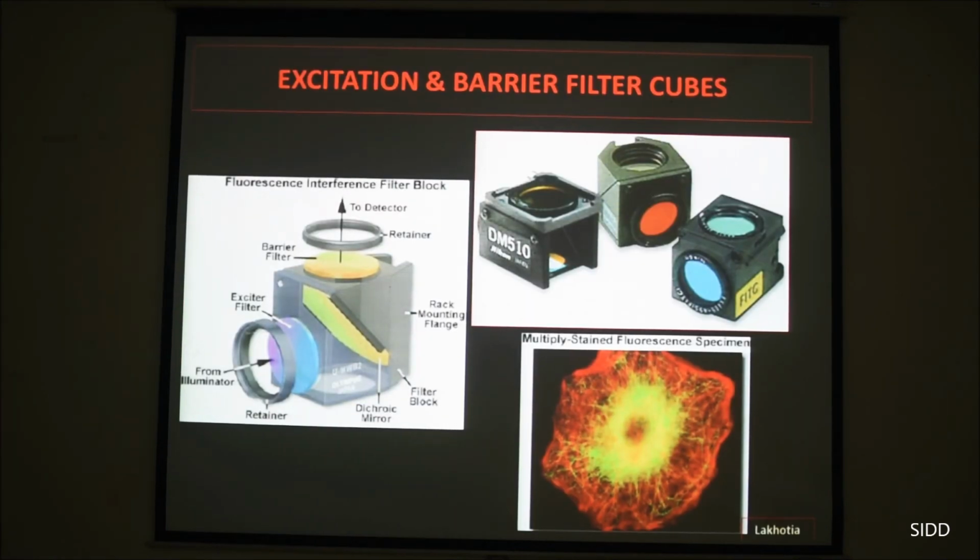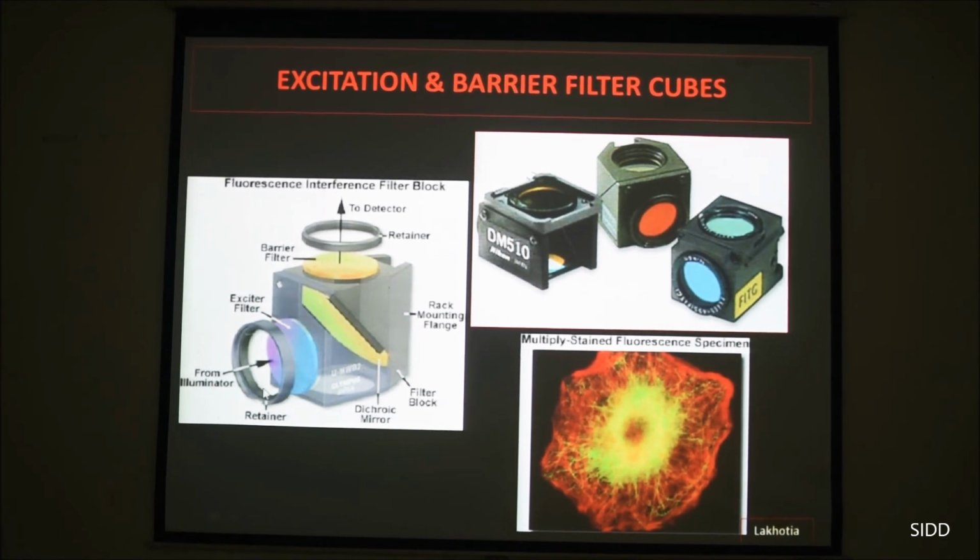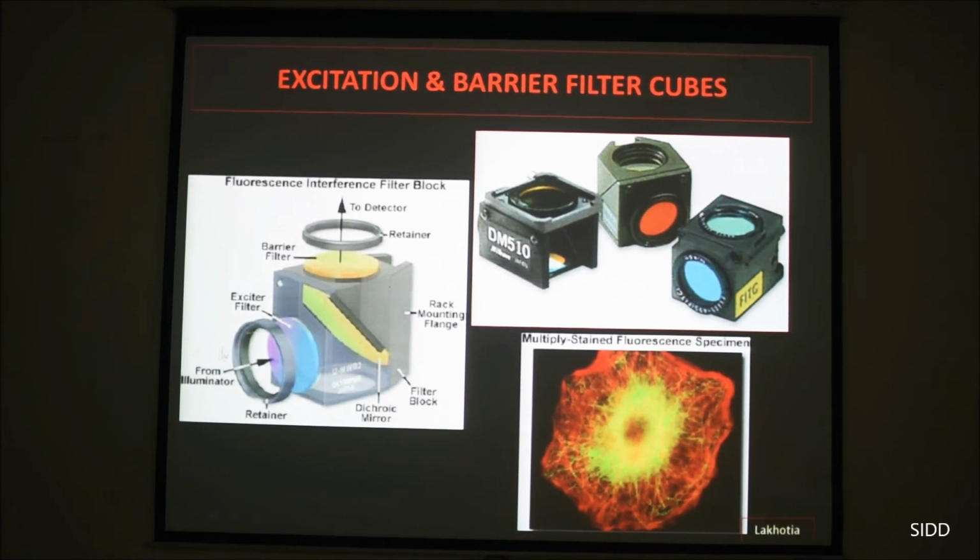The fluorescence filter cube will allow one wavelength of light to pass and illuminate the object. The illuminated object now returns two wavelengths: the original incident light, one particular wavelength, and the fluorescent wavelength. And what this filter cube will do is allow only the particular wavelength that we want to reach our eyes. For example, this filter cube makes use of a very simple system, in which this side is the light coming from the source of illumination, for example, mercury light, completely white light.